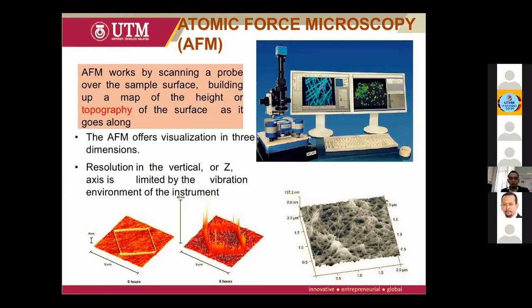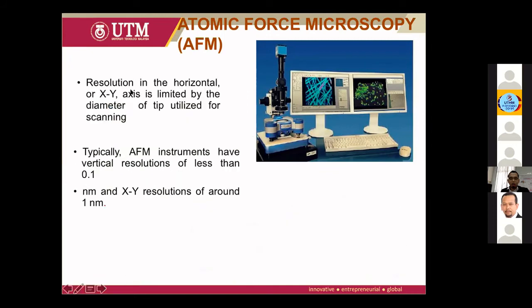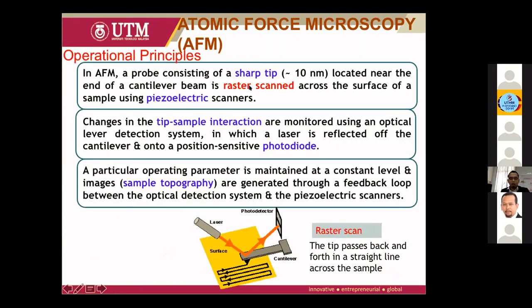This is going to be very beneficial if you develop a sample of polymer electrospun nanofibers, things that are combined with the polymer. You need to see the overall structures. Okay, so how this works, it's like you have a finger pointing at your face, and this is using what we call the tips, a sharp tip, and there are different modes of the tips that operate to give you the overall topography.